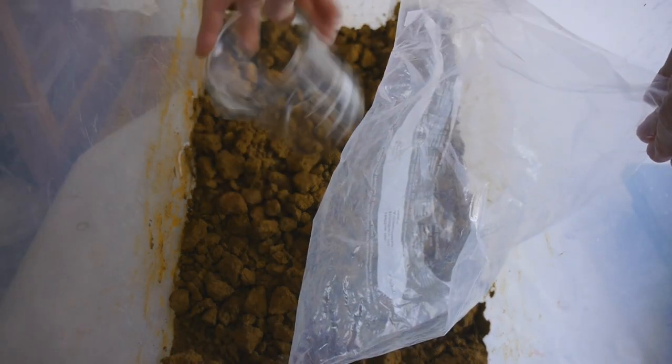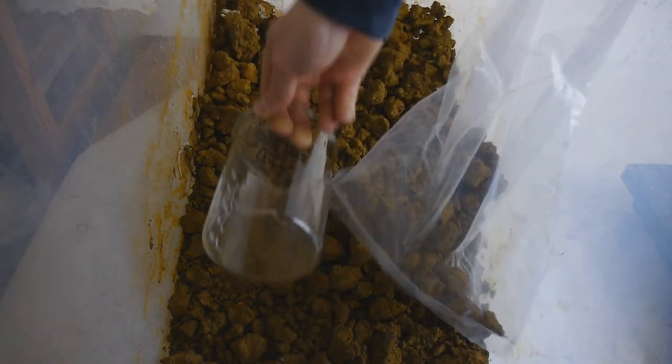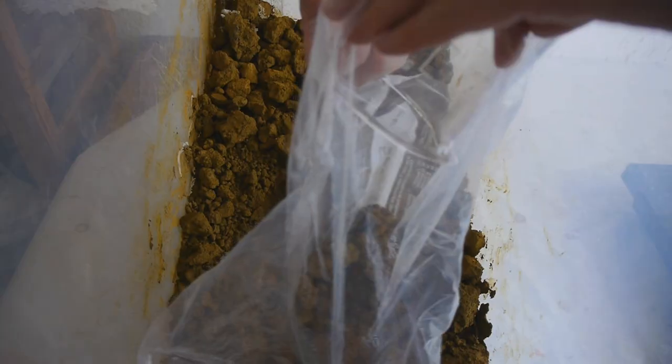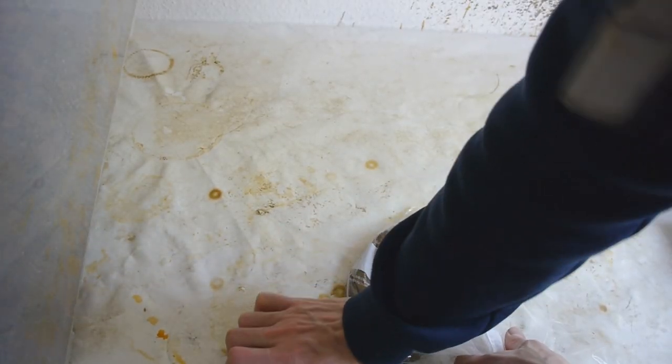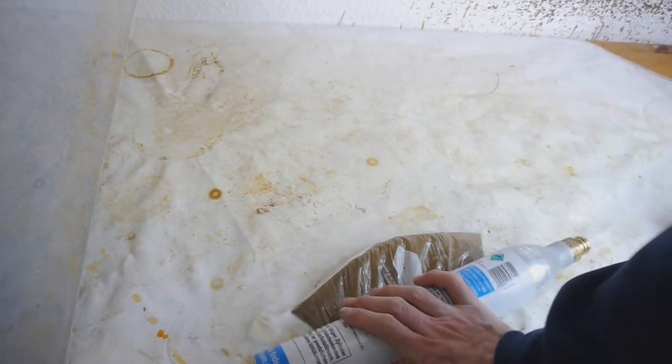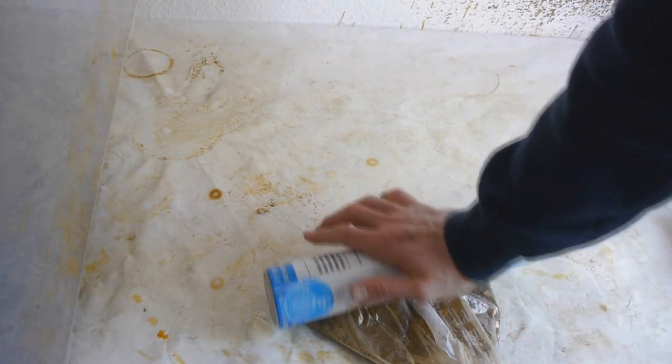So for that we'll use our trusted 1/2 liter beaker to fill some of this iron oxide hydroxide into this bag. Then we use our hands to crush this up into a powder as good as we can. Helping yourself with some mechanical tools like the CO2 cartridge for example is also a good idea.